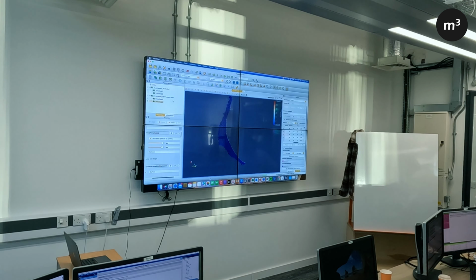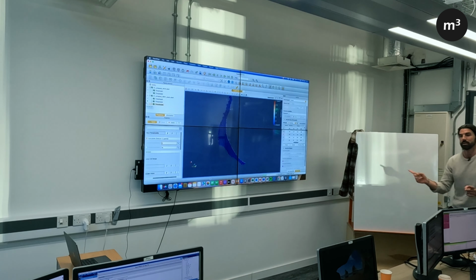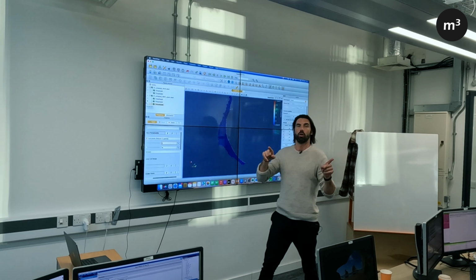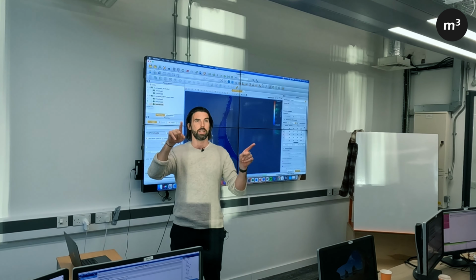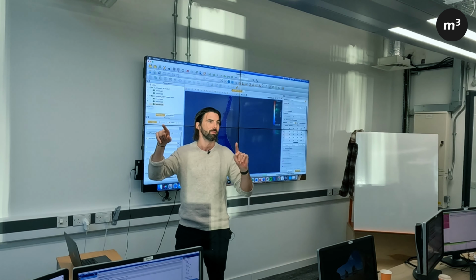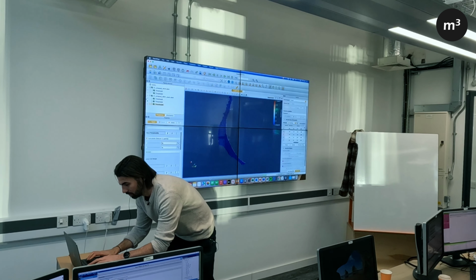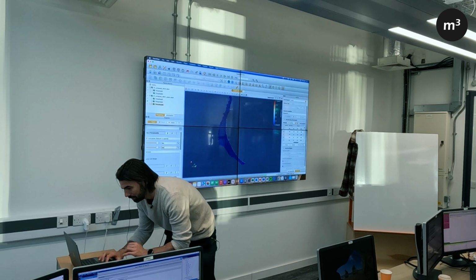So then if we go again, threshold, feature 1, which is because I think it's basically similar to how your feature IDs are assigned randomly. Your feature ID on each side of the boundary will just be randomly assigned. So some of them are feature 1, some of them are feature 0. So if we go 164, 164, hopefully this works.